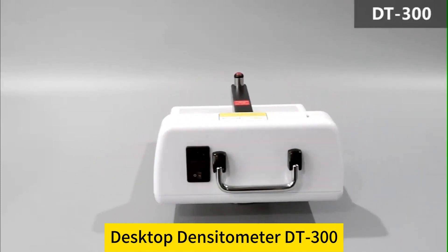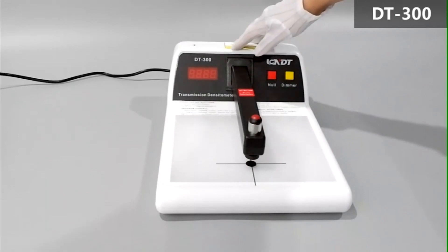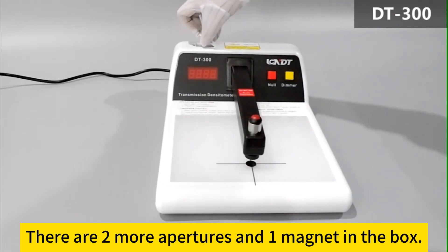Desktop densitometer DT300. There are two more apertures and one magnet in the box.